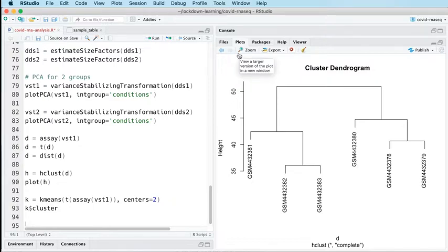Once we've got some differentially expressed genes, and we've dealt with annotating those differentially expressed genes, which is the task that we'll undertake in the early part of next week, we'll come back to these techniques and look at them in a bit more detail. I do sometimes realise that I go over things quite quickly, especially as things have got more complicated and more detailed. So we will come back to this.